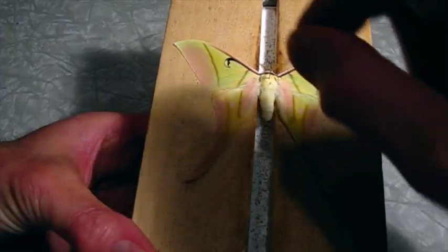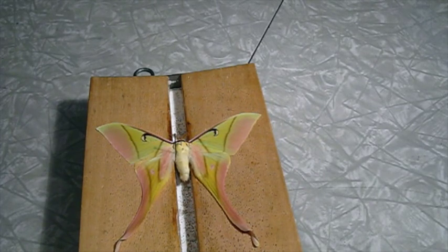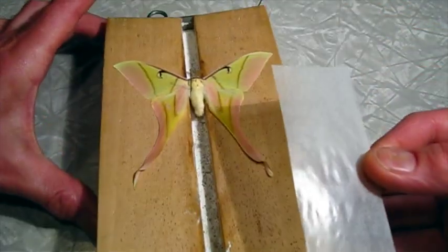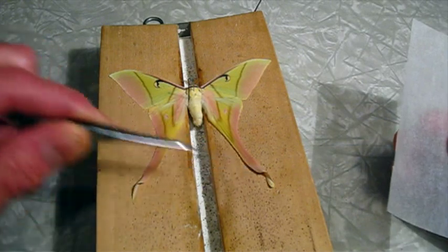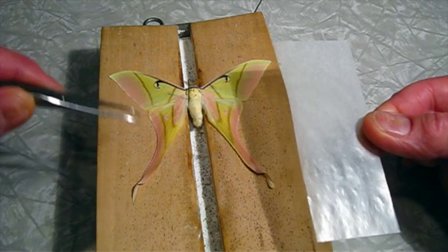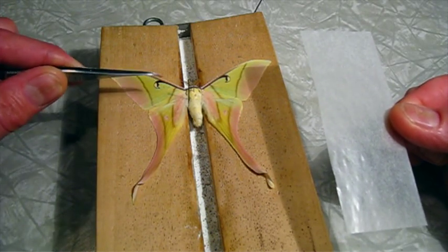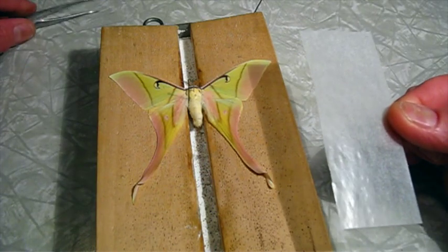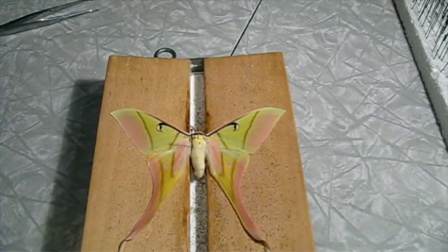I need to brace the abdomen so it doesn't move. I have my sheet of glassine pre-cut — I think that's going to be about right. I want to hold the wings down, but these tails down here are folded with a little spiral on them, and I don't want to smash that with the glassine — it's very nice looking and I want to leave that natural. Normally we bring the fore wings straight up so the lower part is perpendicular. With these luna moths I think they look a little better if they're not quite so high, so I'm going to play around with this a little bit. I think this piece of glassine might be too long, but we'll see.